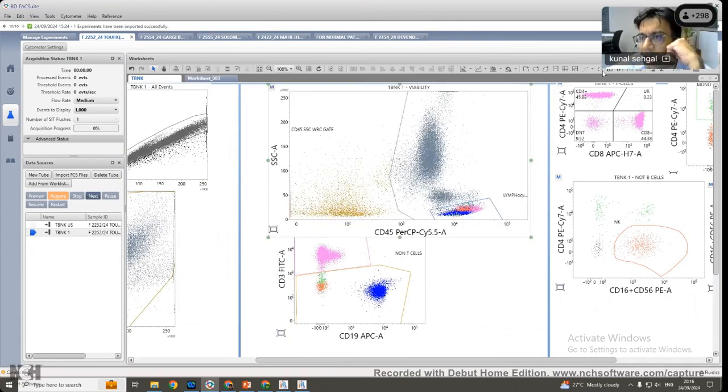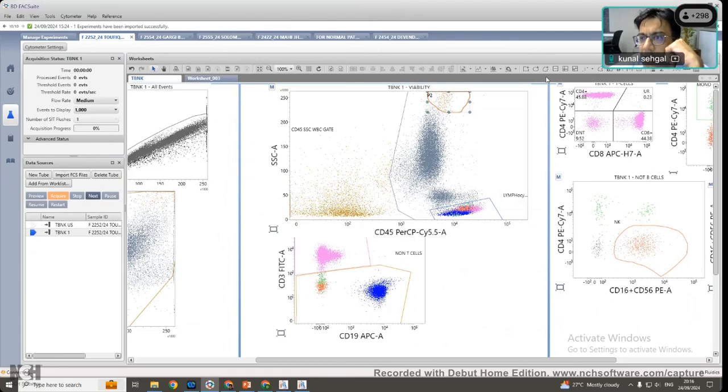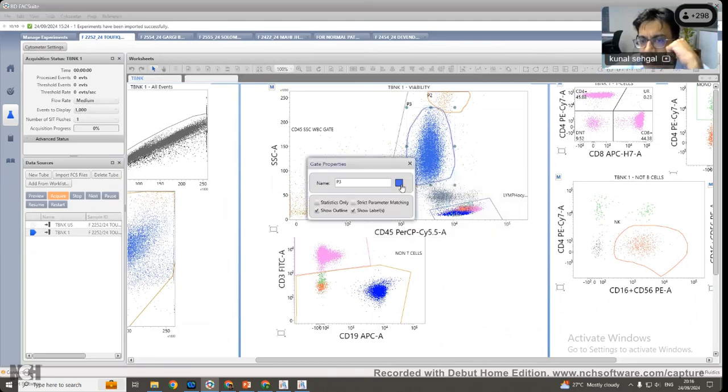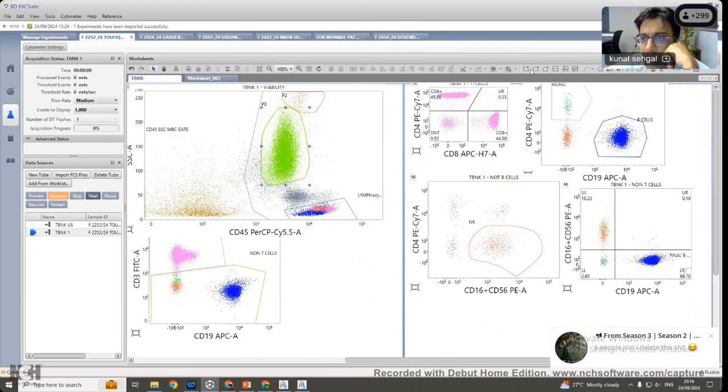Just a few markers we have seen. Now I'll identify one more population. I'm going to give it a color. Give it some different color. Say orange. And we can give these cells a green color. Okay. Now I can make a plot.